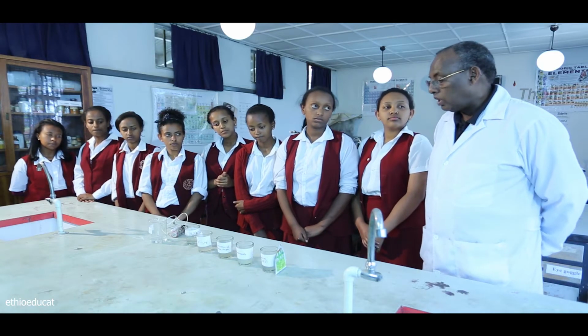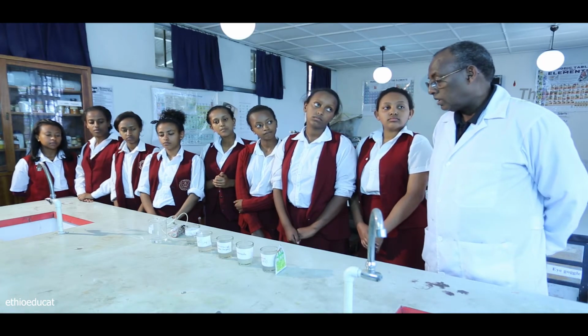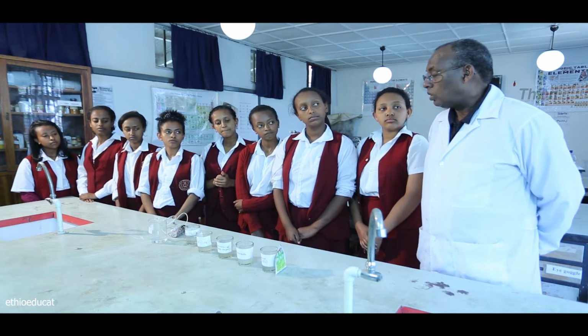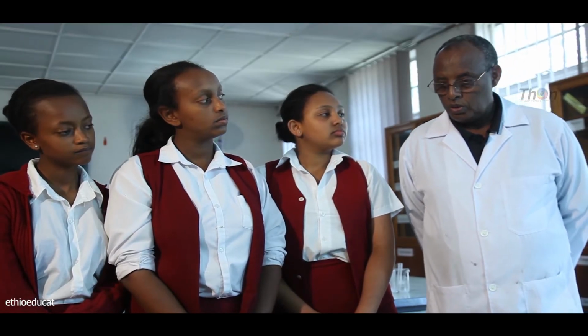If the bonds are ionic, there are freely moving charged particles that would complete the circuit, which otherwise would not conduct current. So from here on, you try to explore what kind of bond you have in the following solutions. Ready? You could start.